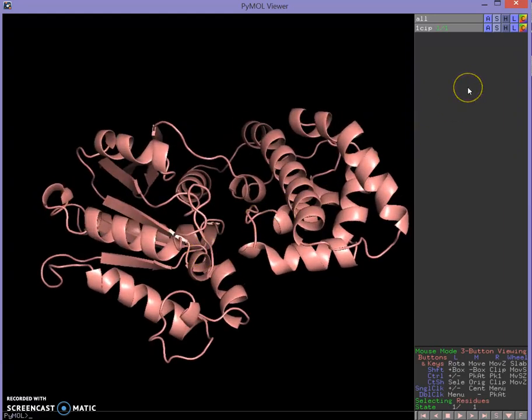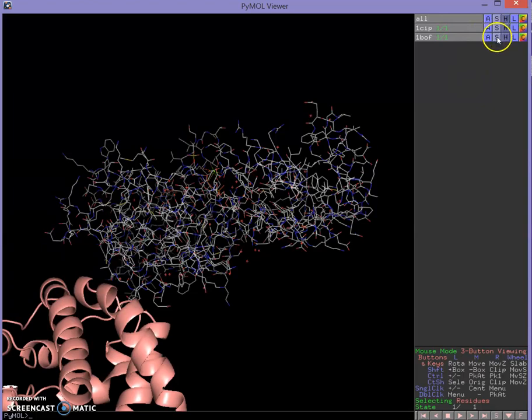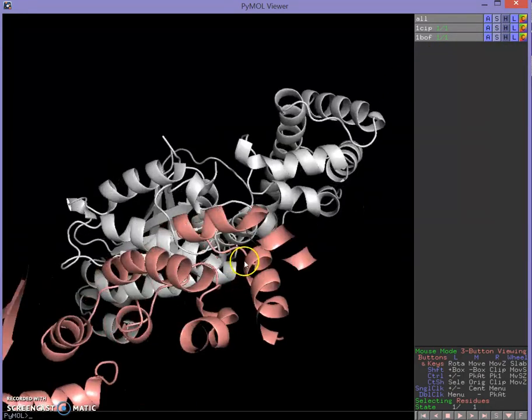Now we also want to bring up our other form of the protein because we're going to do what's called a morph between them, so we can see how the protein moves as it does its job. So we're going to fetch 1BOF — that's the GDP-bound form — and we'll also show that as cartoon.